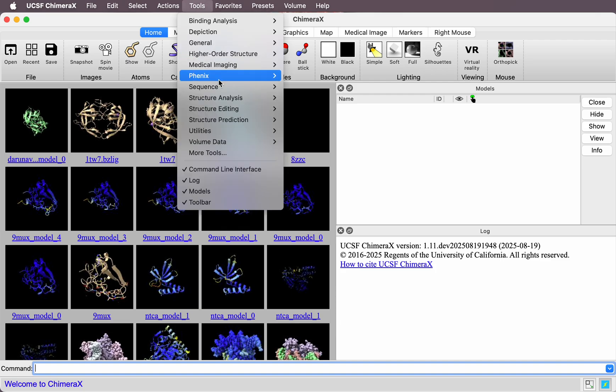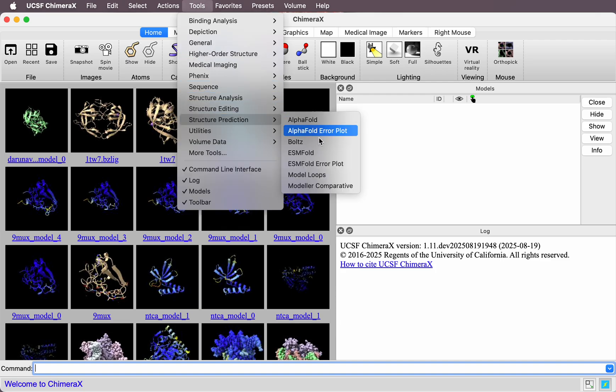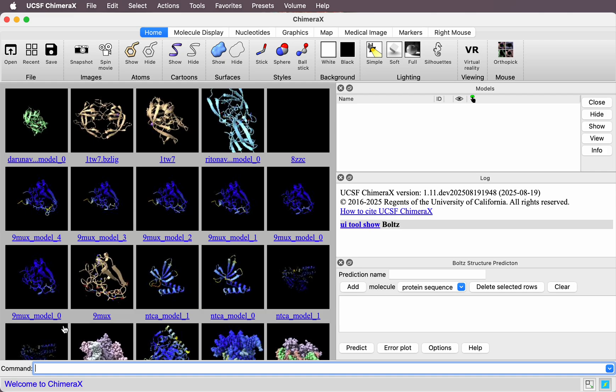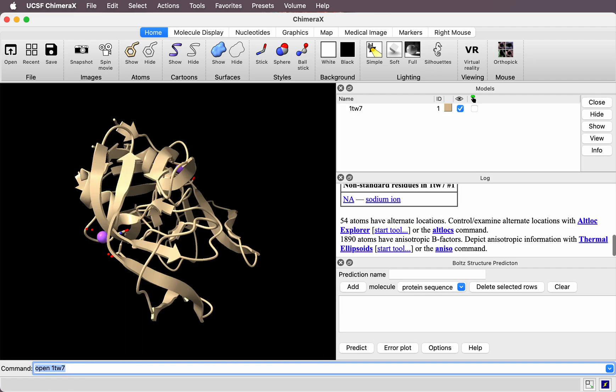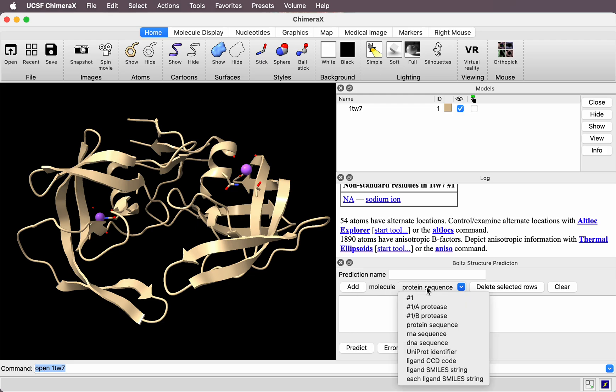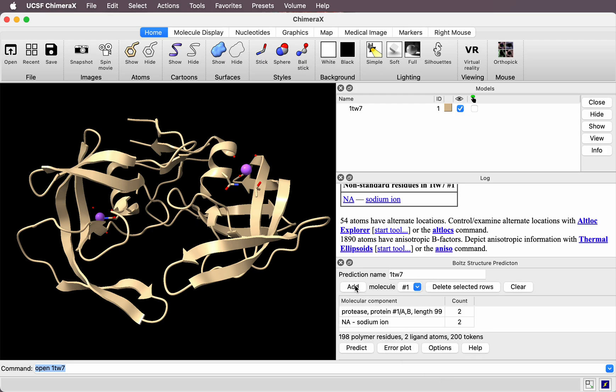I'll go to Tools, Structure Prediction, Boltz. The first thing I need to do is add the HIV protease dimer. I could paste in the sequence, but I can also take it from an existing structure. I'm going to open an existing structure instead—it's a little easier. Then where it says add molecule, I'll choose number 1 and press add.